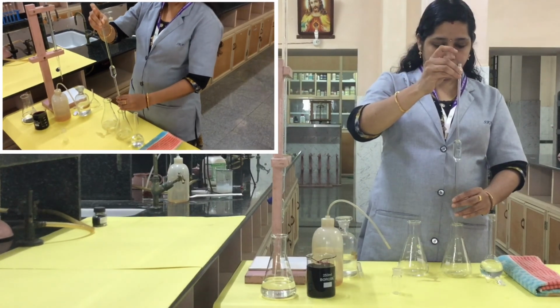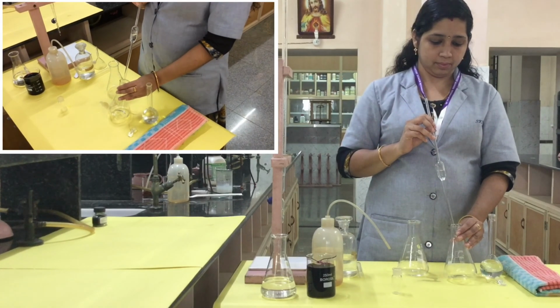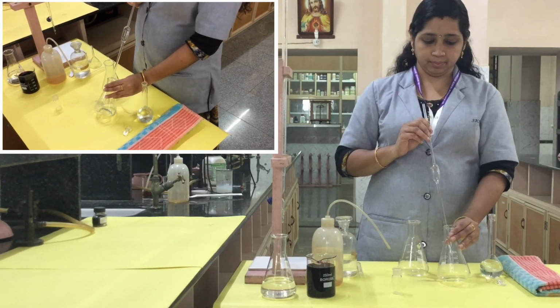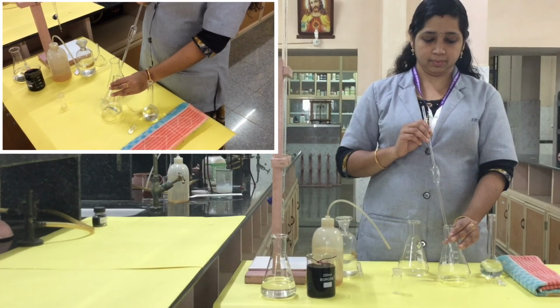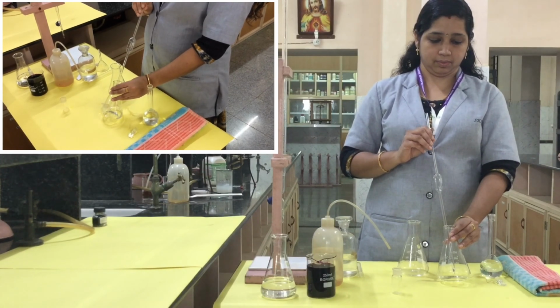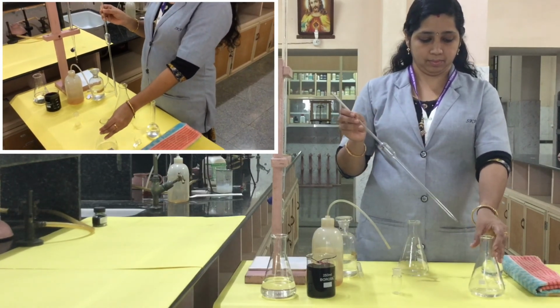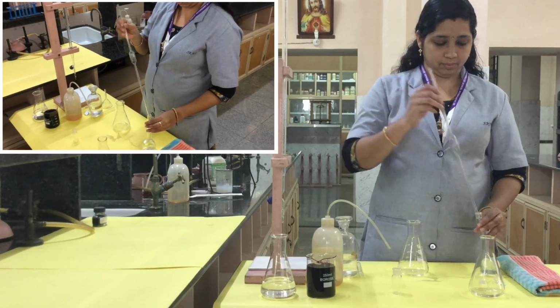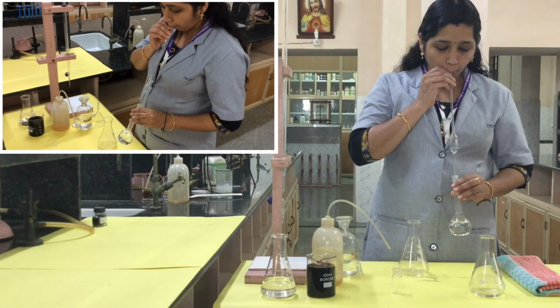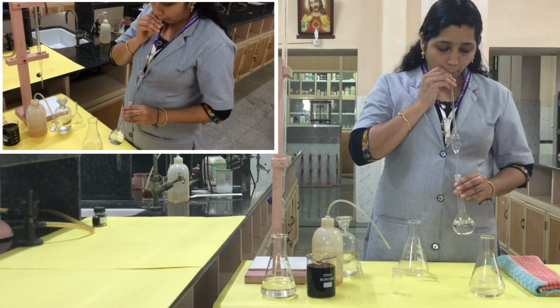Keep aside this conical flask. Then pour this 20 ml Mohr salt into the conical flask. The last drop just touches the base. Okay, so now 20 ml of Mohr salt you pipetted. Again, one more conical flask is there. We want another 20 ml to pipette out and set aside for carrying out the titration.